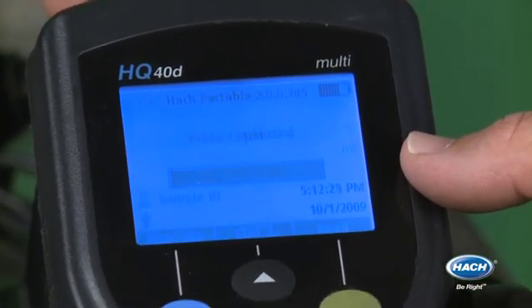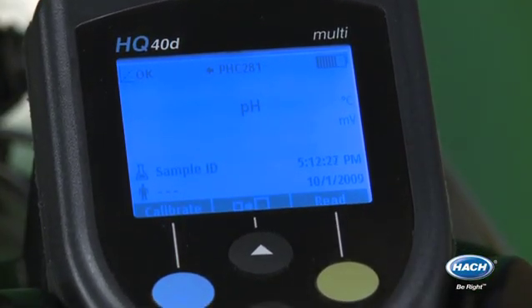The current calibration and calibration history is stored in the probe and the calibration routine is also ready to go. There's no need to scroll through menus or punch buttons to get the meter ready to measure. It's just plug and read with one touch of the button.